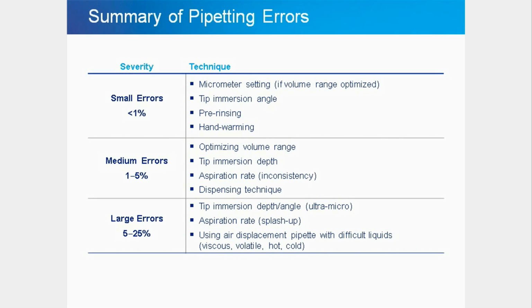Keep in mind that errors can be cumulative, so consider this as you decide which techniques to use. The most important consideration should be that good pipetting means good technique, which equals minimal errors and results in good data.